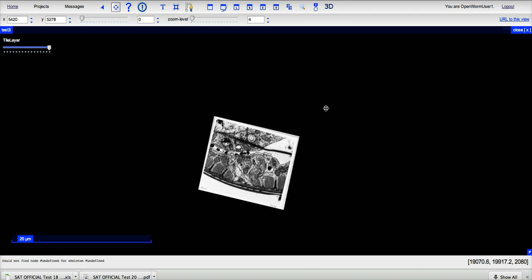So you'll be presented with an image such as this one, and you'll have a group of 2 to 5 images of which you'll have the ownership over to begin to annotate the neurons and the synapses. So there are 205 images in this data set, and as you can imagine, to do that all yourself may take an appreciable amount of time. So just starting with a small number of images will make it more manageable and allow us to work on this project in parallel with one another.